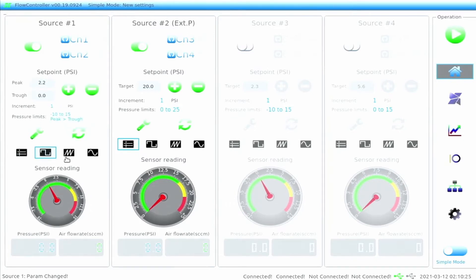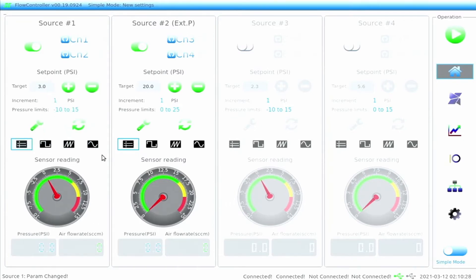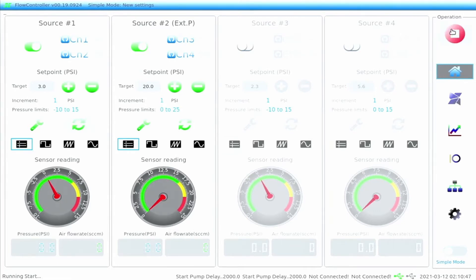The black square icons allow the user to select between several different pressure wave profiles. The real-time monitoring zone along the bottom shows the user a real-time pressure pointer display, as well as the pressure value and air or liquid flow rate. Once parameters have been adjusted to the user's preference, the run button in the top right will start the pump.